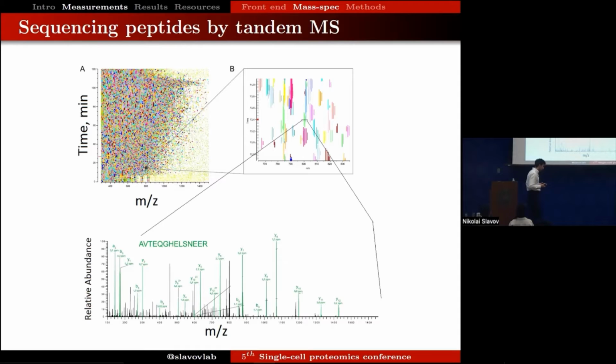The challenge then is that simply seeing the peptide-like features is limited because we don't know their sequences. We don't know what they are, and we know that they're peptide-like, but some of them may not even be peptides. And simply by analyzing the features, we generally cannot determine their sequence. Because if you take a peptide and permute the amino acid sequence, you're going to have the same mass but a different sequence. And therefore, just measuring the mass is insufficient. The way to solve this problem is to fragment the peptide, measure the fragments, and then from these fragments, we can determine the sequence. If we measure enough fragments, we can sequence the peptide de novo. Oftentimes, we may not measure enough fragments, and then the statistical analysis becomes challenging.